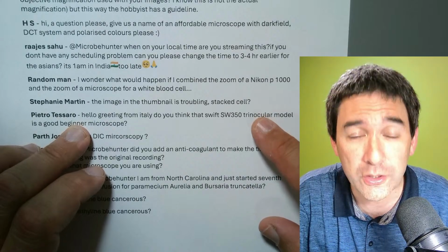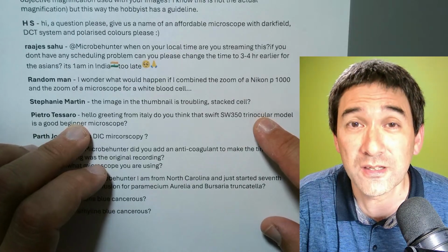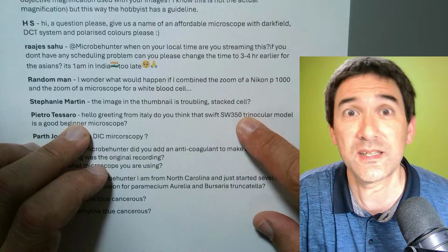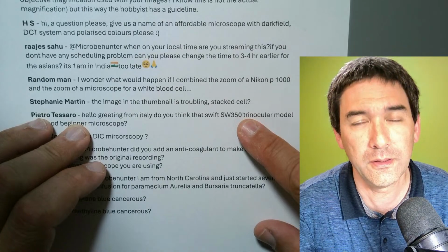Generally, what I recommend is not to invest too much money at the beginning, but this is, again, something that, like I said before, it's a question of taste. And some people are going to say, oh my gosh, why would you buy that? Buy yourself a used Zeiss standard microscope, a used one from eBay, and put it together yourself, because that's much better, right?